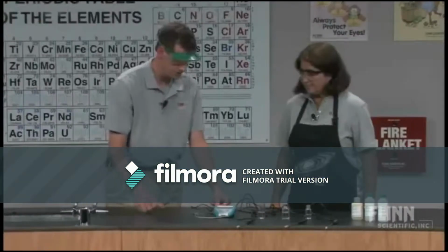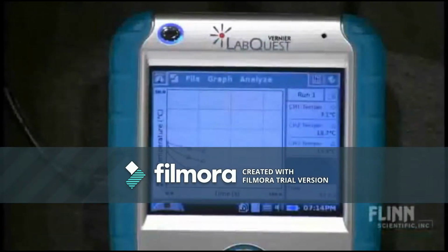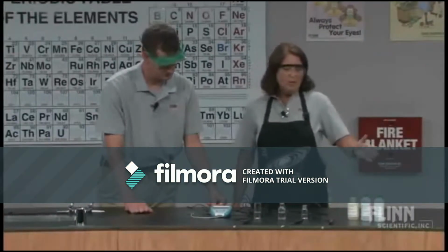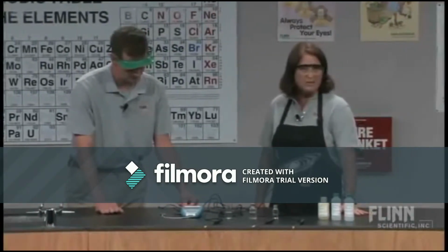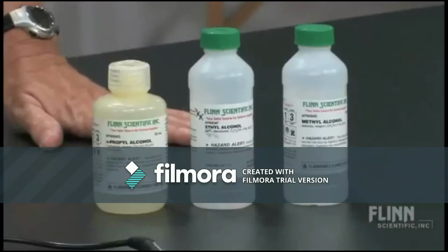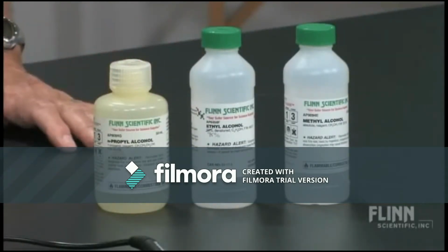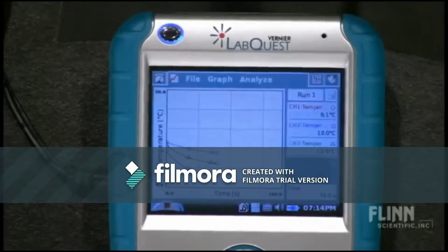It appears to me that they're not all cooling off at the same rate. Well, there's got to be a reason for that, wouldn't you think? I would think so. Yeah, we could go ahead and talk about that. Well, in this particular experiment, we're using 3 different alcohols. Now, the difference, let's talk about similarities and differences. They're all alcohols, so they all contain the same functional group, an OH group.